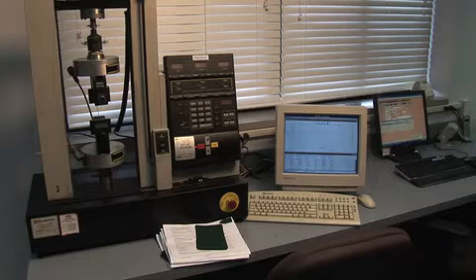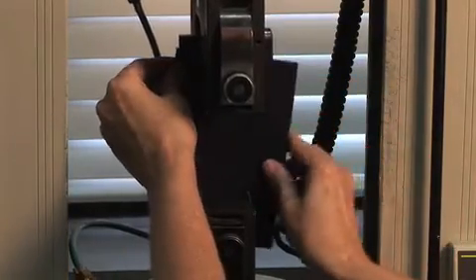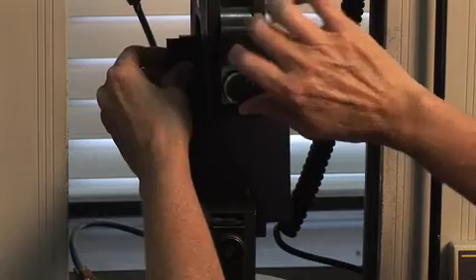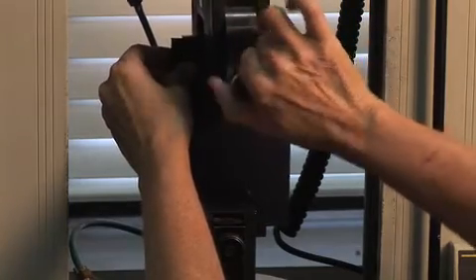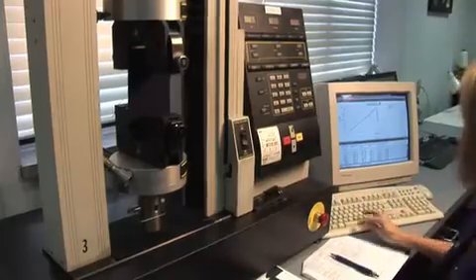Break test. The break test is designed to determine the strength of the fabric by testing the force required to rupture the fabric sample. To conduct this test, a pre-cut fabric is placed lengthwise and centered in the Instron machine, then clamped and secured. The lab technician activates the Instron machine by depressing a foot pedal.